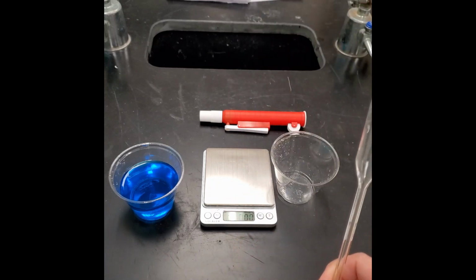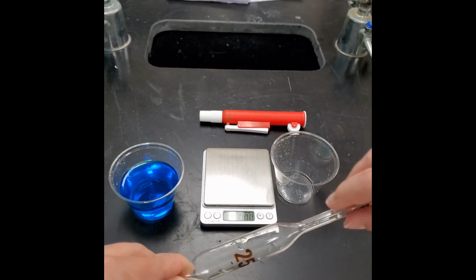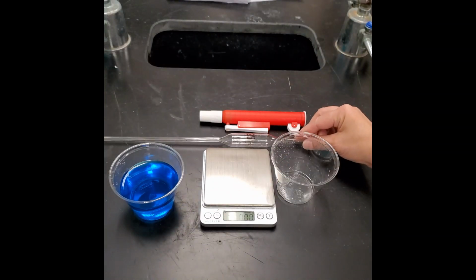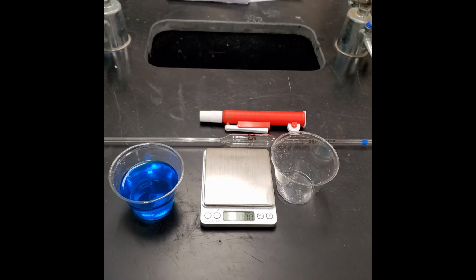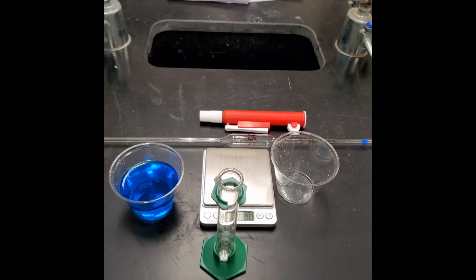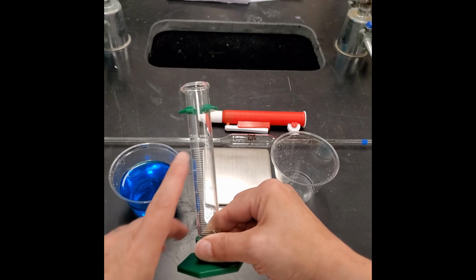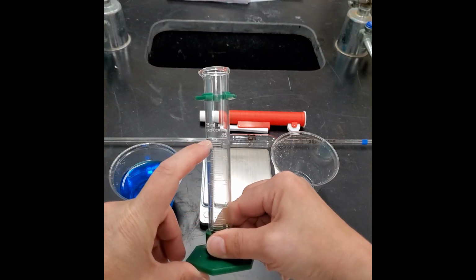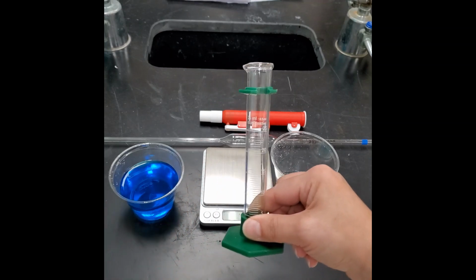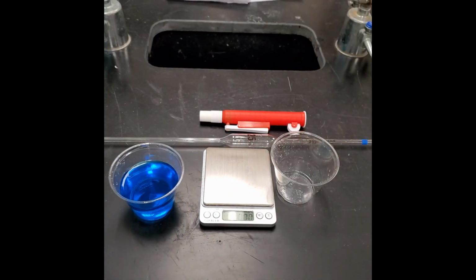Now, there are two classes of glassware. One type of glassware is a to contain type of glassware, and one is a to deliver type of glassware. A graduated cylinder is a to contain. When I measure out a 25 ml sample of water or something into this graduated cylinder, it contains 25 milliliters. Then when I pour it out, it doesn't necessarily deliver 25 mils because there's some liquid left behind.